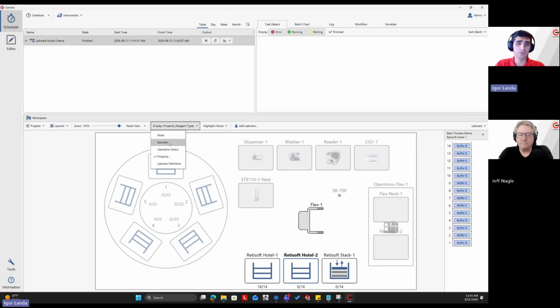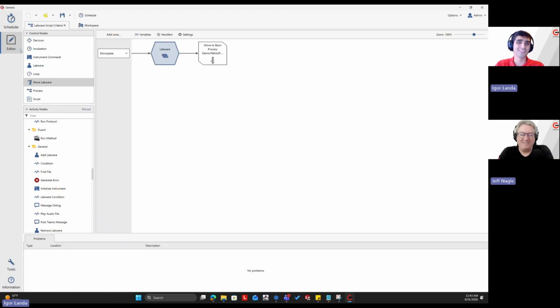So now what we're going to do is barcode. As we can see, we have a list of barcodes, some with an initial of IL and some with an initial of JN. Where'd that come from? I know, I wonder where those came from.